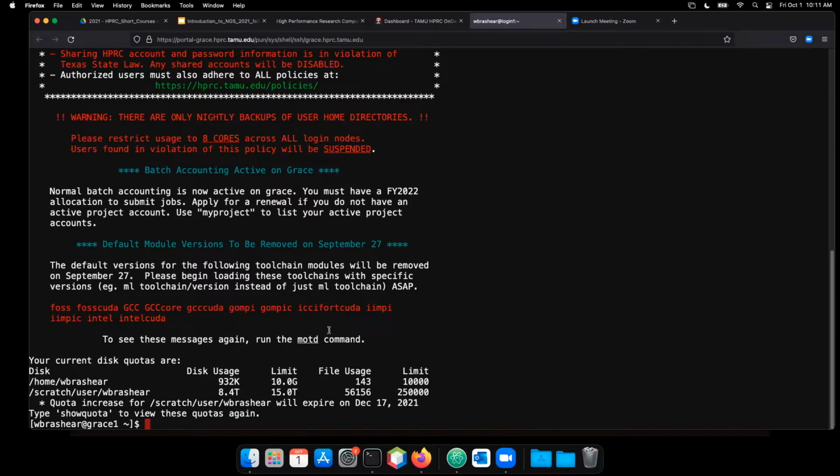Right now, for example, I'm doing a project that has several hundred samples in it, and aligning all of those creates very large alignment files, right? In the normal non-binary alignment file format, that takes up quite a bit of room. So it's important to monitor that so you don't go over your quota.